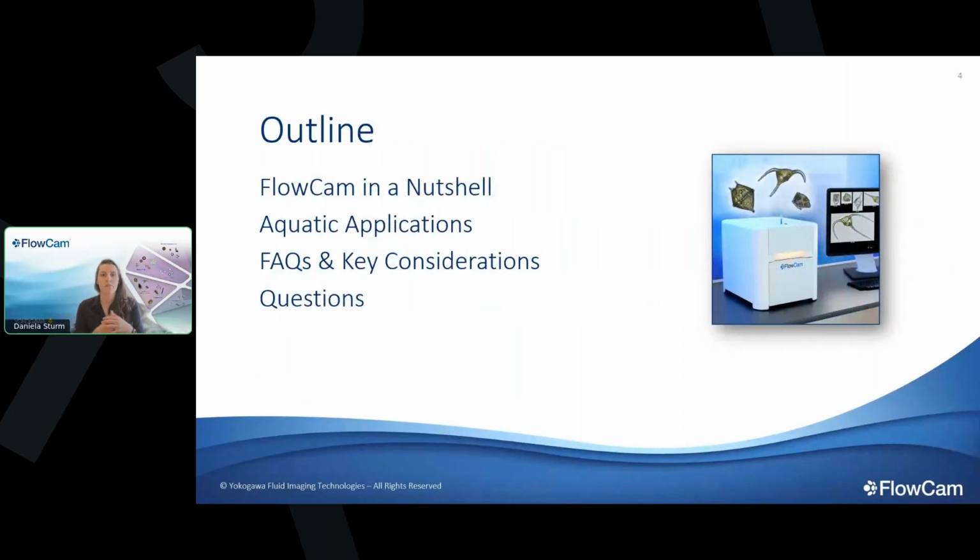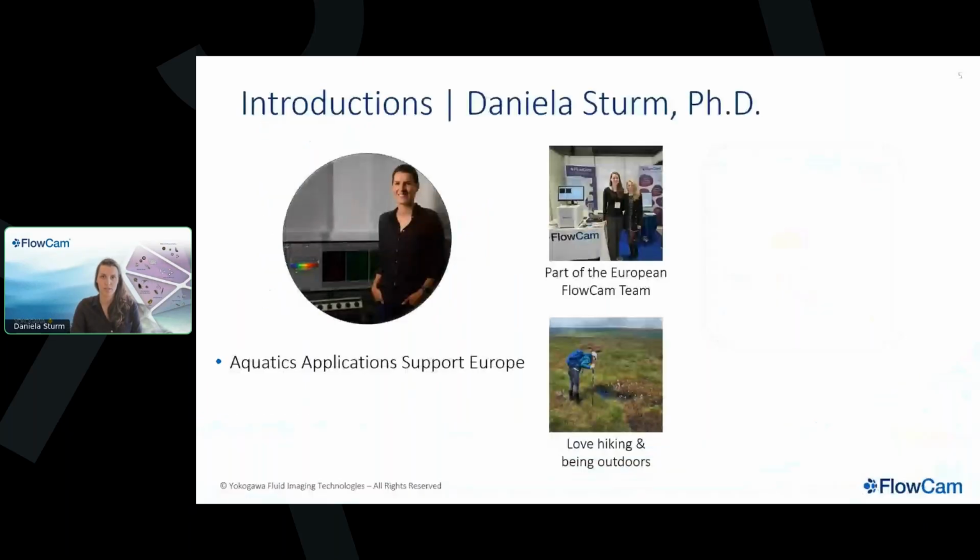I'll start with a short introduction, then give you a high-level look at how FlowCam works. After that, we'll move into the heart of the session, so real applications across different areas of aquatic science. And then towards the end, I'll cover some of the common questions we get and considerations that we hear most often. So yeah, and then of course, at the end, we'll finish with time for your questions.